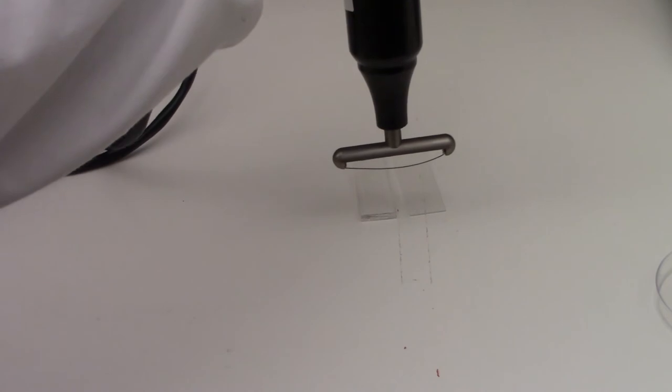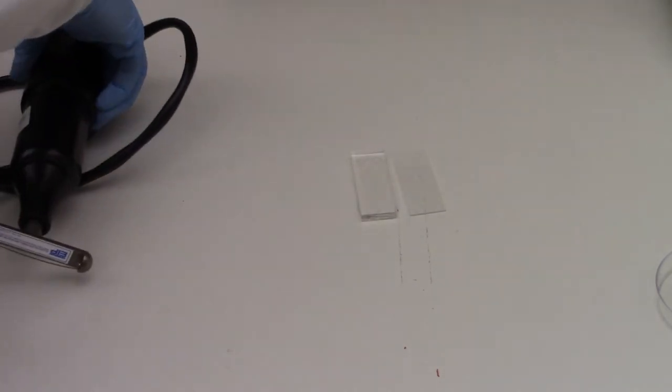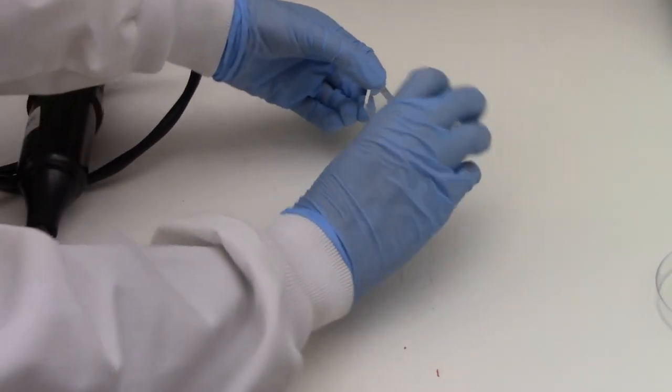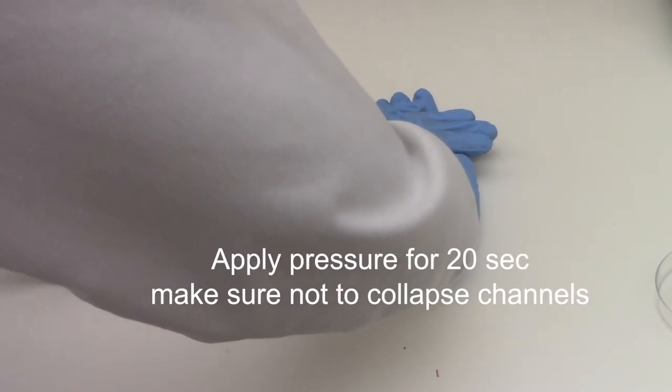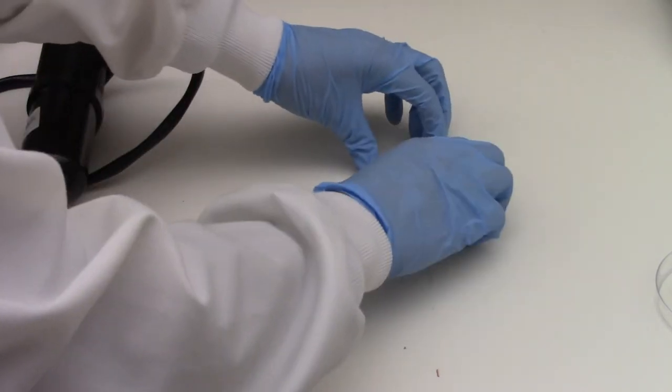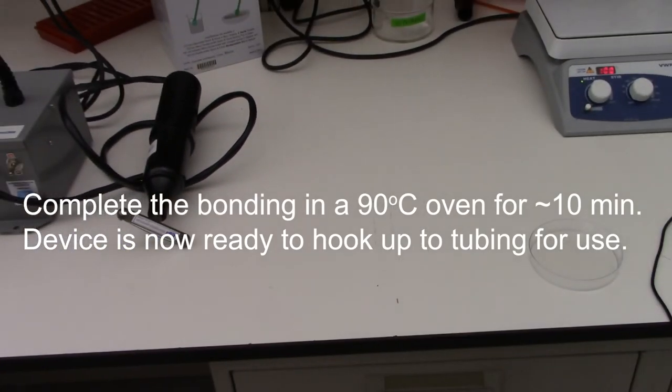Once that's done, turn the plasma wand off before setting it on the table and then quickly flip over the PDMS device onto the glass slide. Then apply, depending on how big your device is, either use your fingers or in this case, I'm using my whole hand, apply a light but firm pressure for about 20 seconds. And then the next step will be to lock this chip to a 90 degrees Celsius oven for about 10 minutes.